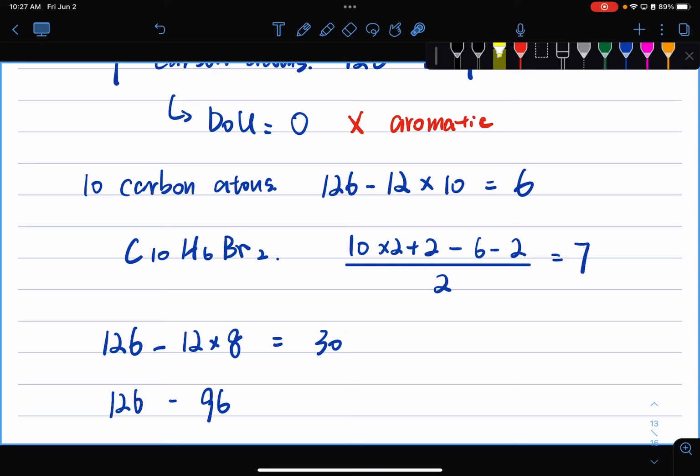No, the IR here is not as informative as it normally would be, especially in the case when we have an oxygen in there. So the IR here didn't tell us too much information. Well, it tells us we don't have a carbonyl, we don't have an OH, we don't have an NH, but we sort of know that already from the mass spectrum.